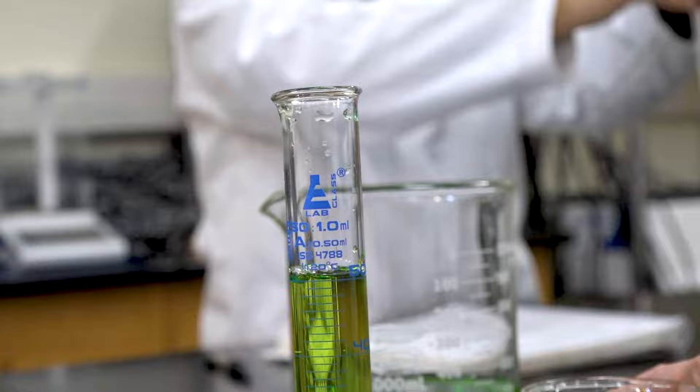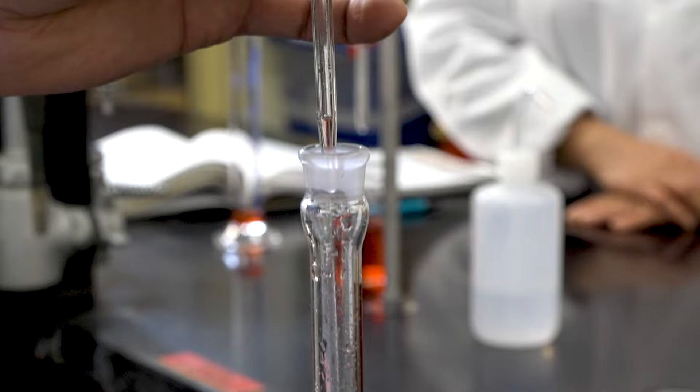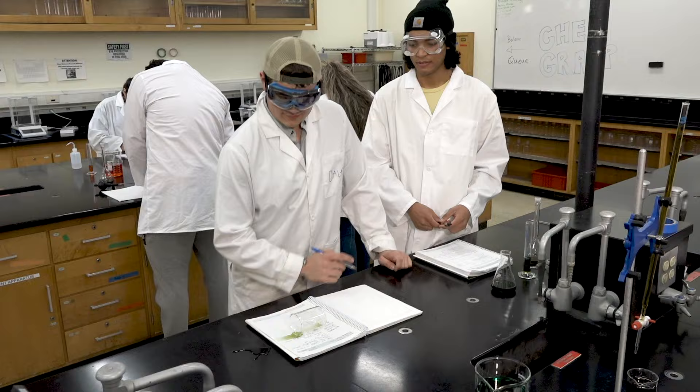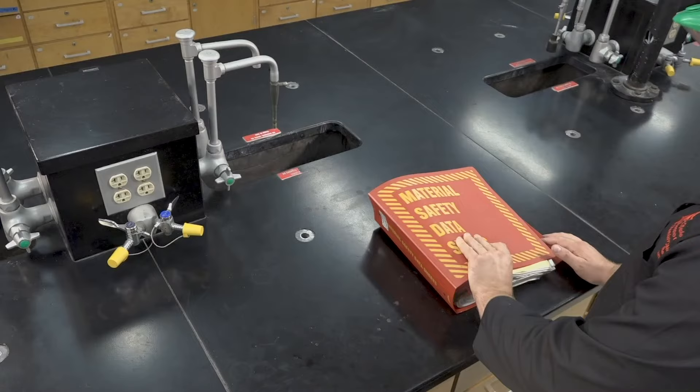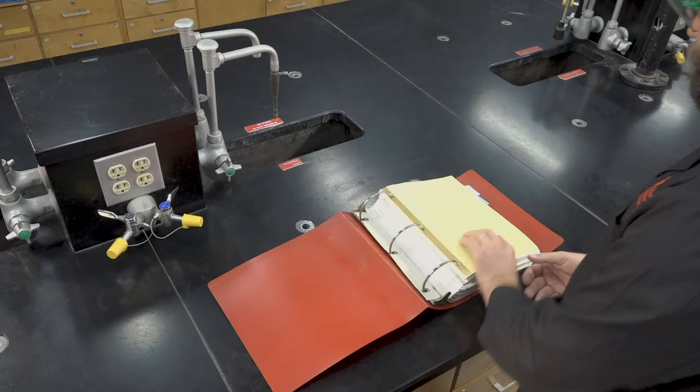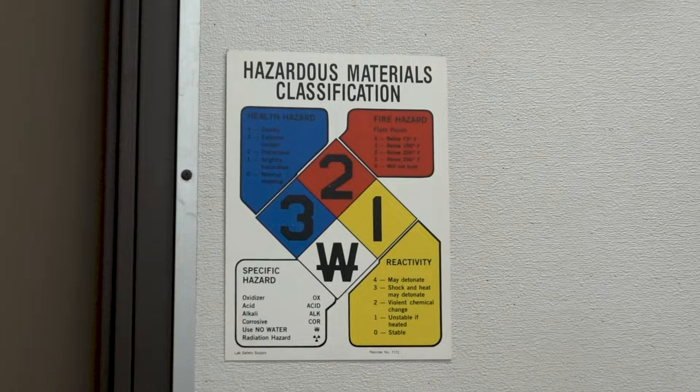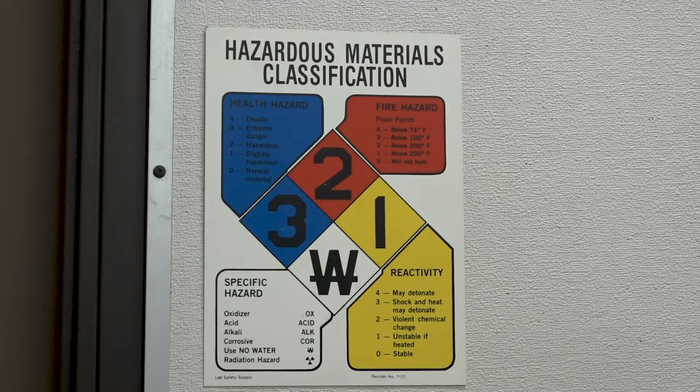The chemistry lab can be a dangerous place, so it's important to know your risks before entering. Before each experiment, you should familiarize yourself with the chemicals being used, especially the relevant safety concerns. All chemicals can be looked up in the Materials and Safety Data Sheet, or MSDS. Chemicals are listed alphabetically by name. The hazmat diamond summarizes the safety of each chemical by rating its health hazard, flammability, and instability. The bottom-most diamond is for additional safety considerations, such as if the substance is reactive with water.